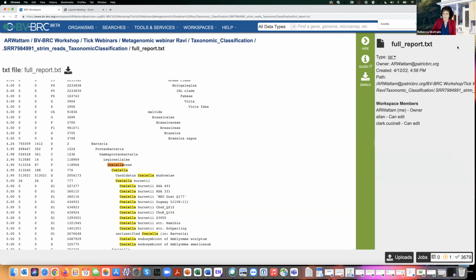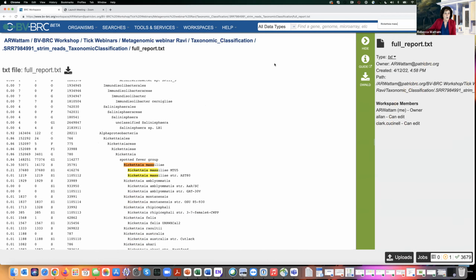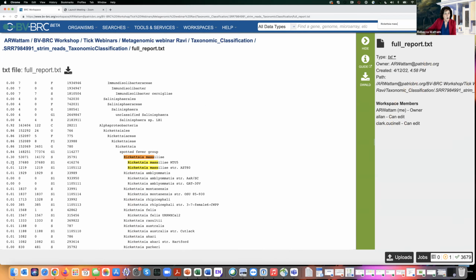That doesn't seem like too much to me. And if I look at the Rickettsia massiliae, only 0.3% or 0.21% mapped to this MTU5. So the question we're going to be asking in the rest of this webinar is, how many reads does it take for you to even be able to pull a genome out of this?